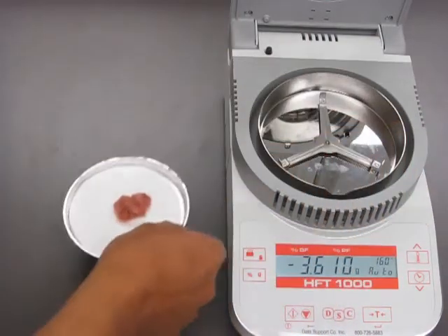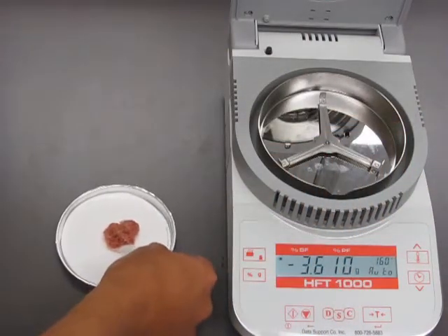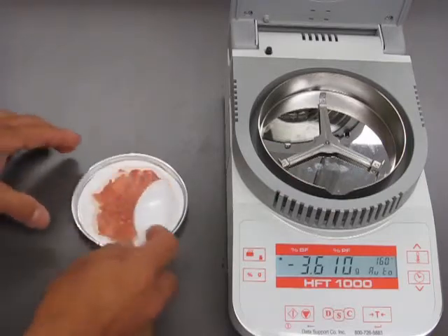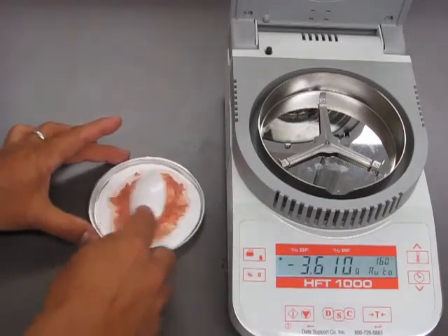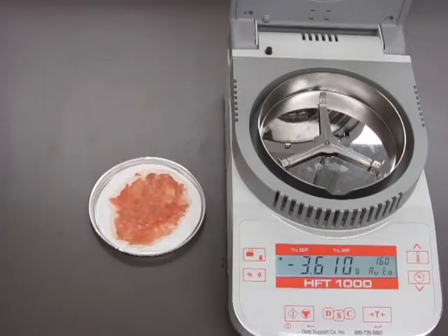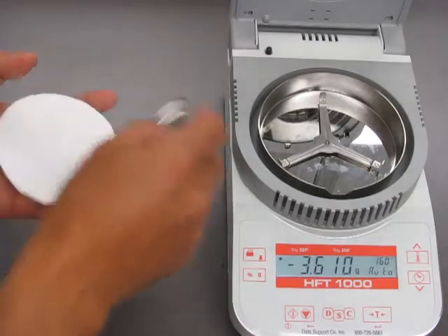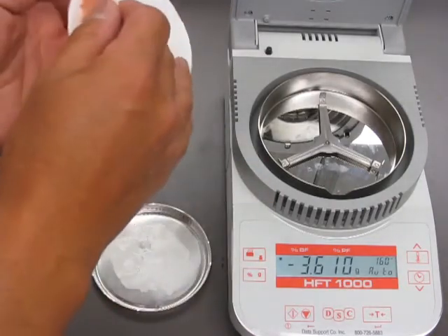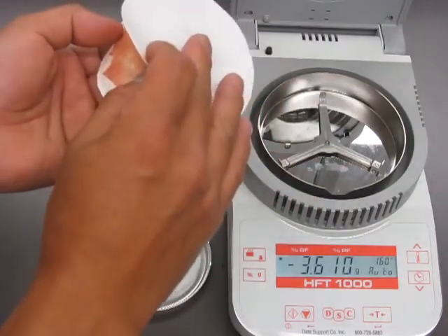You take it down here, and what you do after that is that you spread your sample as evenly and as thinly as possible on the pad. Once you have done that, you grab the pad at the bottom, put it on top.